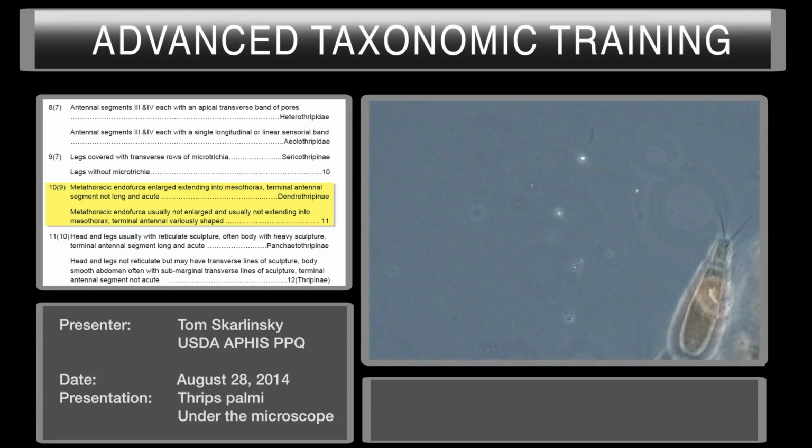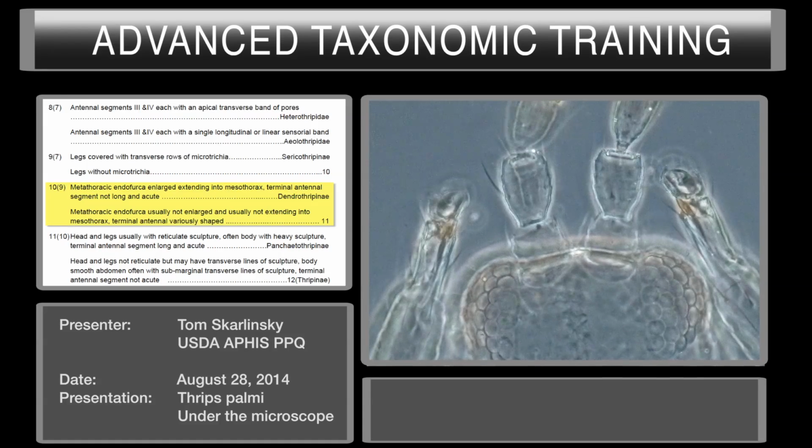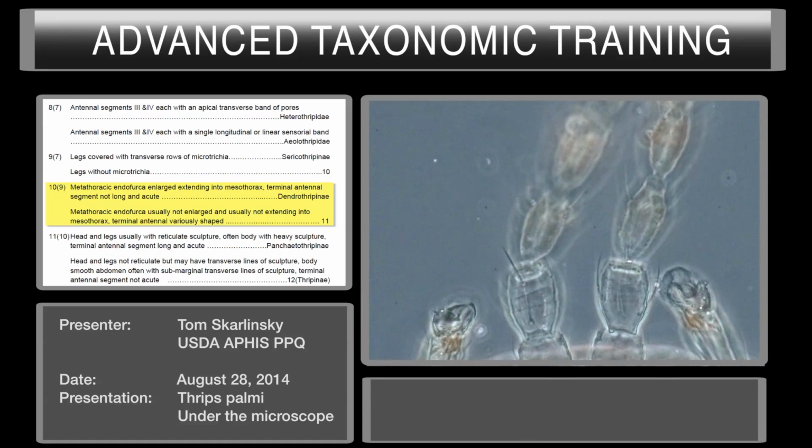Now, is the terminal antennal segment long and acute? It's not long and acute. In other words, this is kind of short. Now let's go ahead and look at the antenna. And let's go ahead and do this. This is something I always like to do.